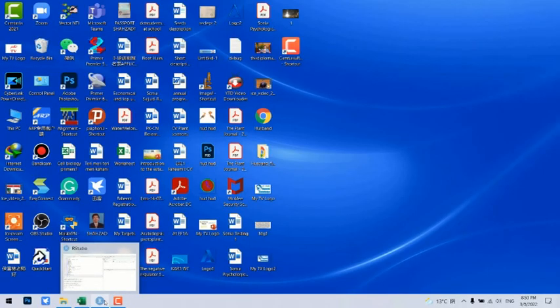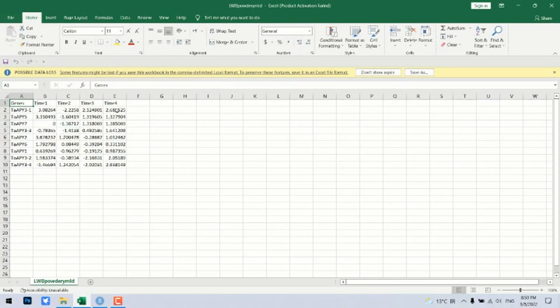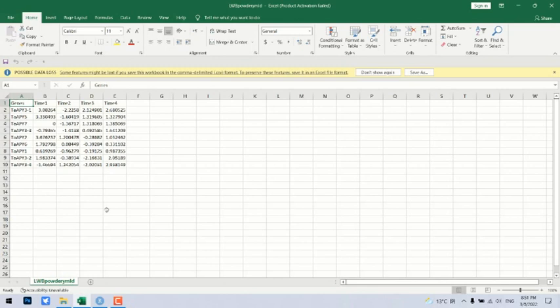Here we are. Today I'm going to teach you people how to make a heatmap in R. Here I have different genes and different time points of their expression: time one, time two, time three, time four. In different, after different hours, gene expression. So we can make a heatmap of it.